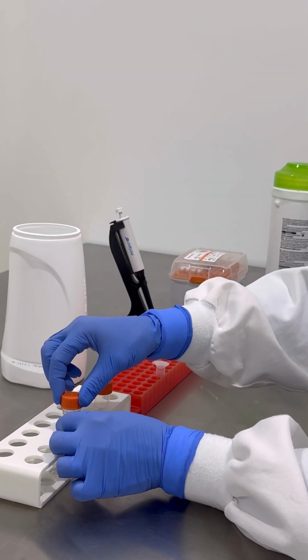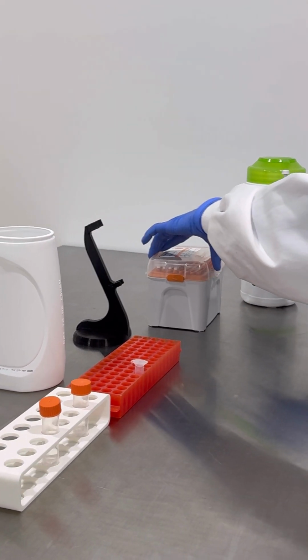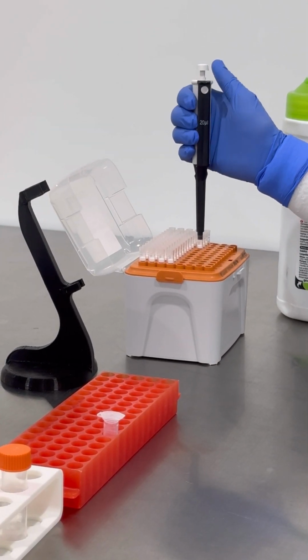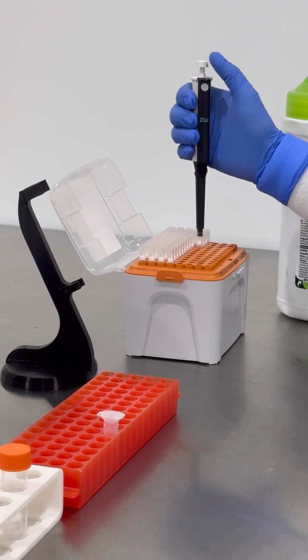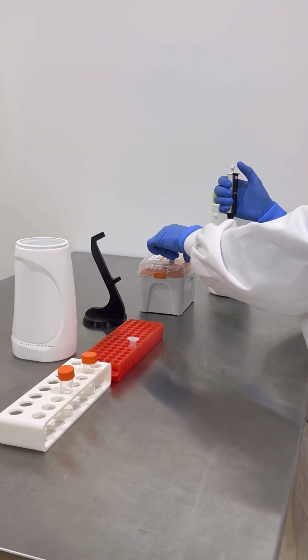Loosen the lid of the sample tube. Hold the micropipette in one hand. Open the lid of the tip box with the other hand. Do not touch the tips. Gently insert the bottom end of the micropipette into the top of a tip. Tap gently to check the tip stays on. Lift the pipette away with the tip on the end and close the tip box.